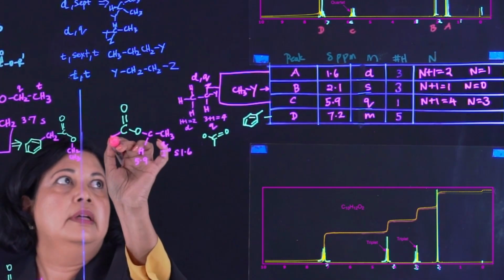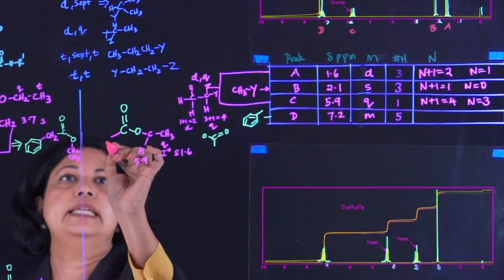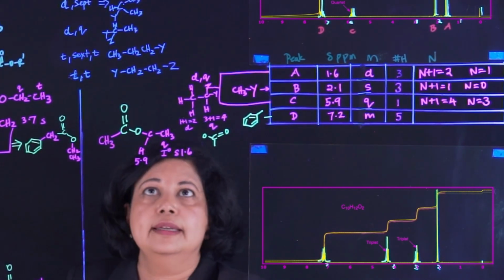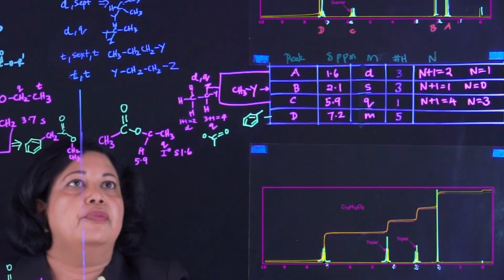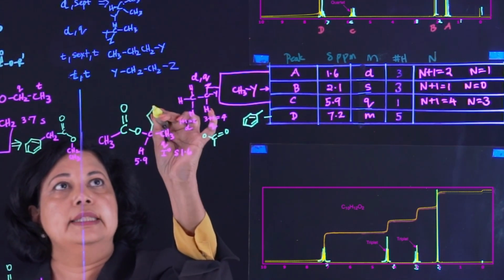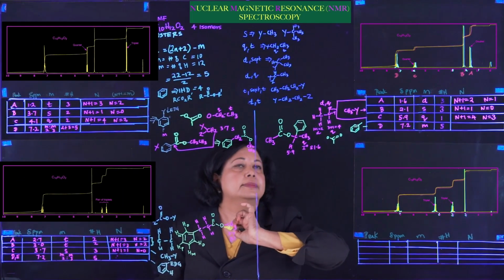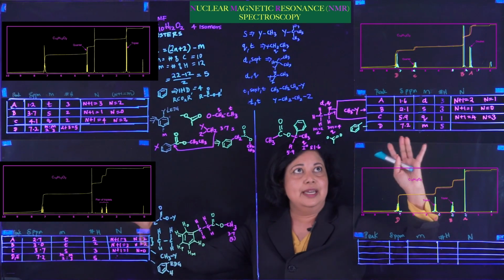The methyl, which is at 2.1, and 2.1 is perfect for sitting next to a carbonyl, like in an acetone. So that's perfect over there. So there's only one choice for a group here, because we know this has got only 3 bonds and it needs another one, and that is a benzene right here. All right, so we're done with 3 of these.